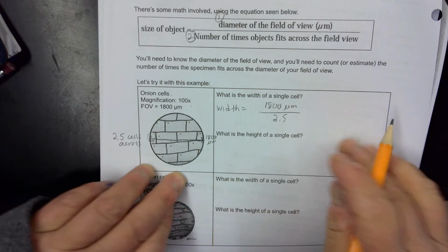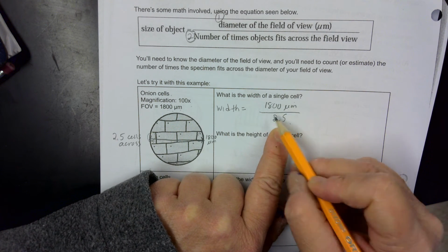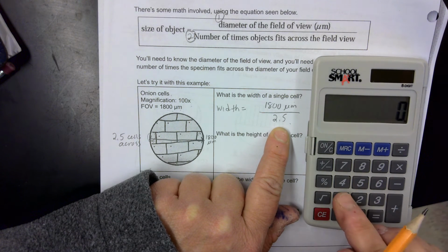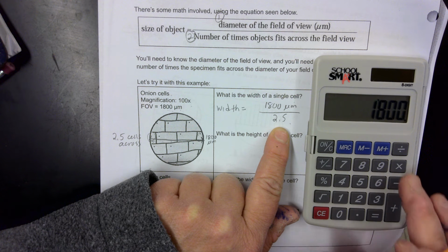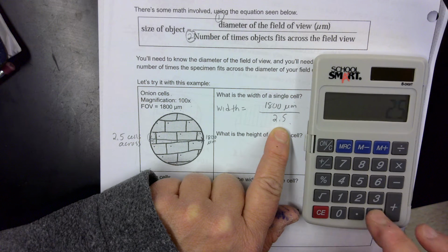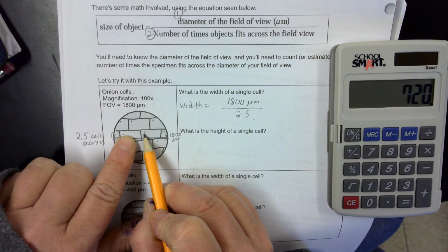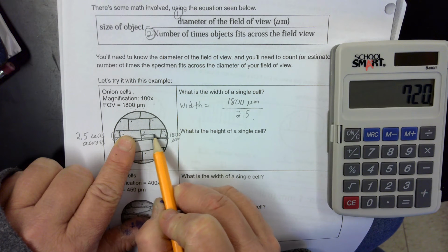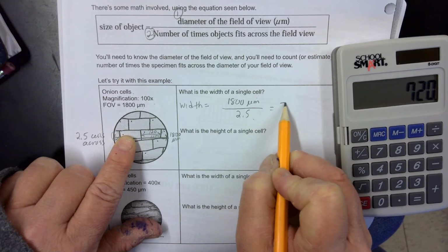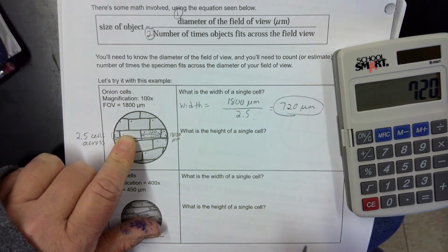Okay. So there's no unit here. This is just the number of cells going across. So now the calculator work comes in, and we want to do 1800 and divide that by 2.5. And so what we see here is that a single cell going across right here is about 720 micrometers. So that's our answer right there.